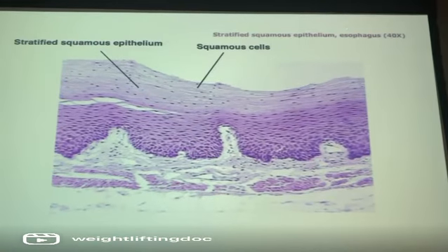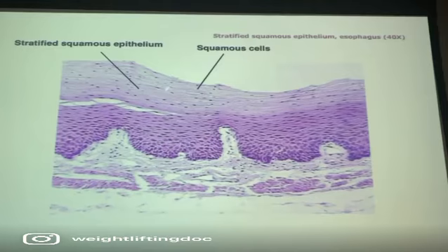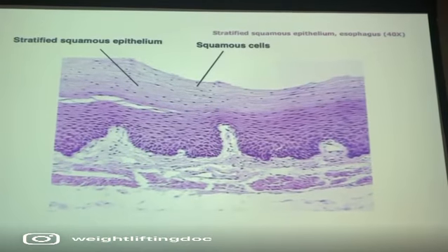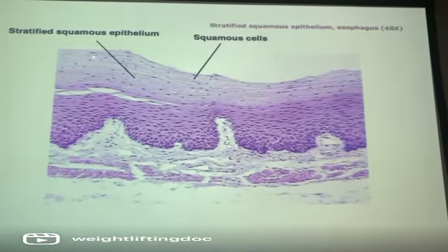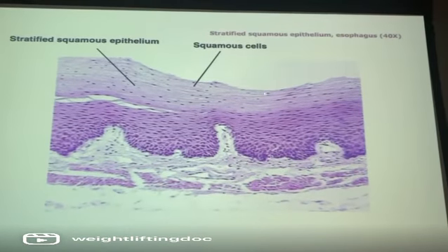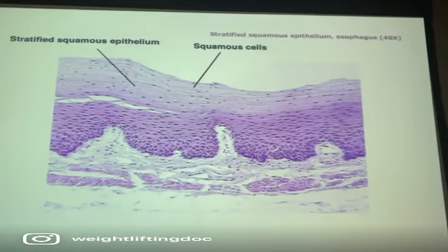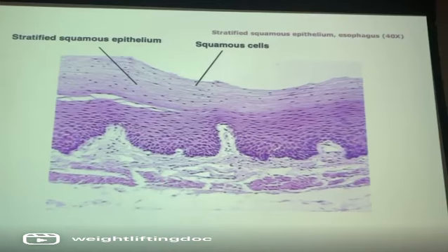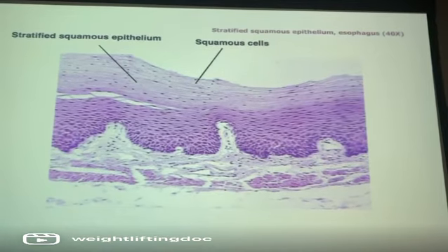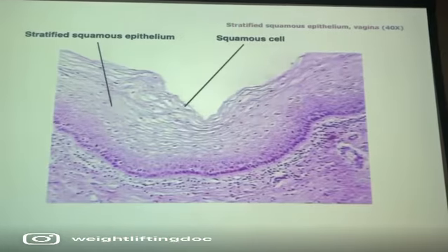Now, you won't have this here, which is esophagus, but if it's in a mucous membrane, then it's going to be non-keratinized. If it's in thin or thick skin, it's going to be keratinized. And so we look for big flaking on the top, which we don't see, which we would see in thick skin. Thin skin, it gets very not so dense in here, right? Very much less dense. So if we're dense and we don't have any big flaking, then we generally look at it and say it's non-keratinized. Okay? We'll go to another one here.